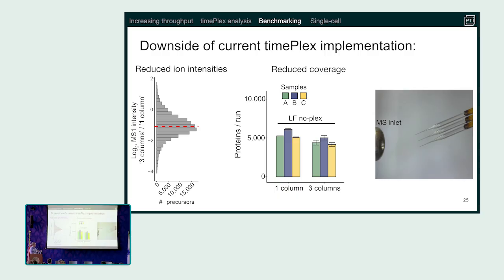This drop is probably going to be less significant as you go to higher and higher protein amounts, because a 2-fold drop at 8 nanograms on an Explorer ends up being very easy, versus injecting 10 times that.